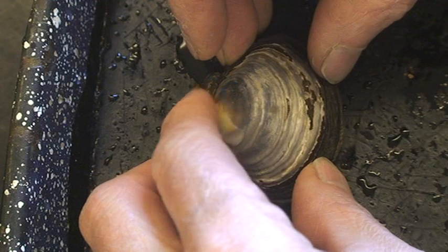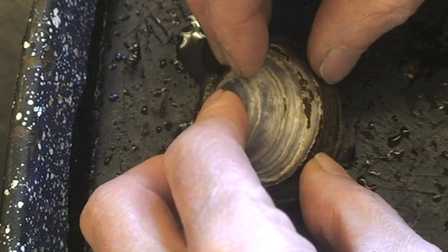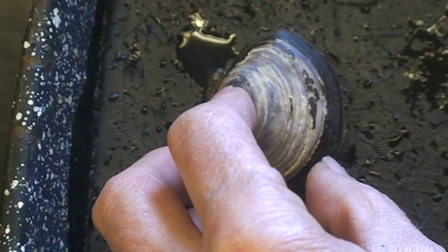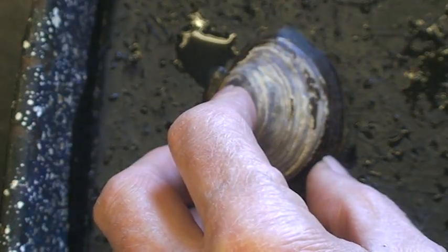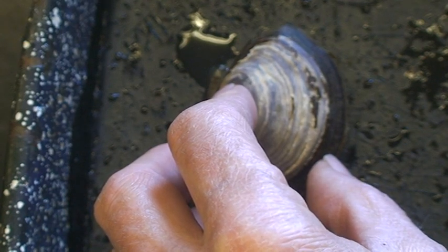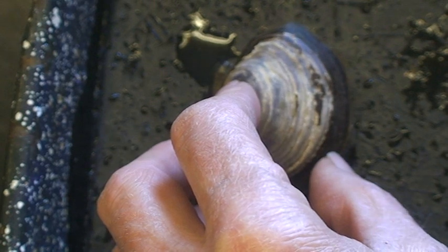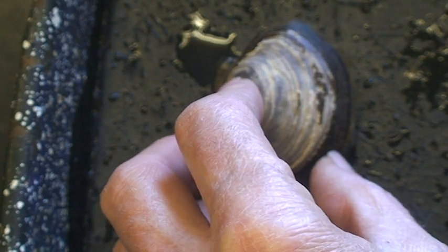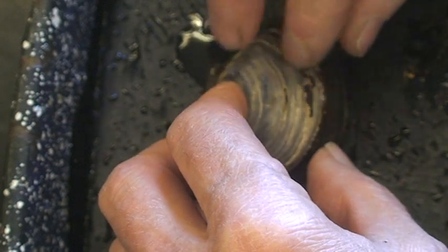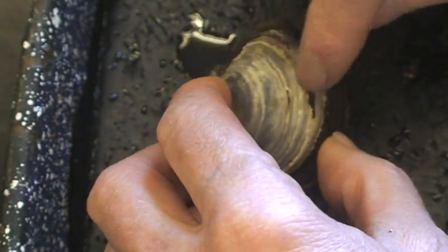It's called the purple varnish clam, and this is not a native species here. It actually comes from Asia. They were imported from Japan and farmed here, but they've escaped from the farms now, and you can find them growing in quite a few places. If you have a quiet beach, like in the Puget Sound area, with a sandy gravelly substrate, probably up high in the intertidal zone, you'll find these things growing there. They're very common there now.